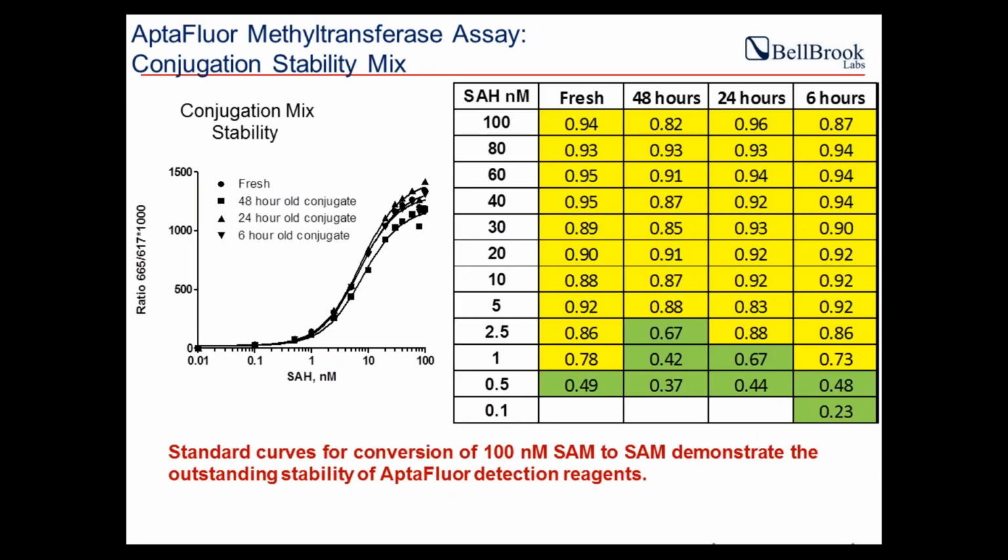So the next thing we wanted to do was to take a hard look at the stability of the reagents and also the signal, primarily because it's an RNA-based sensor. So when we first started working with this riboswitch, we were really worried too, because it was RNA, and RNA is known to, at least that's the stigma out there, that it can get degraded.